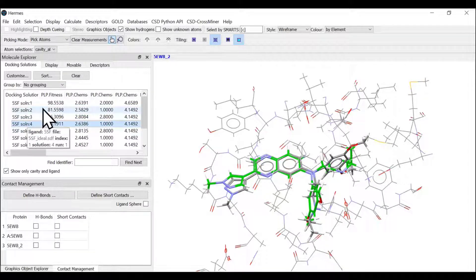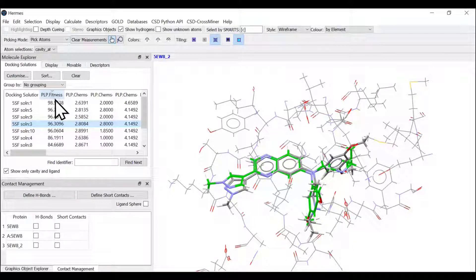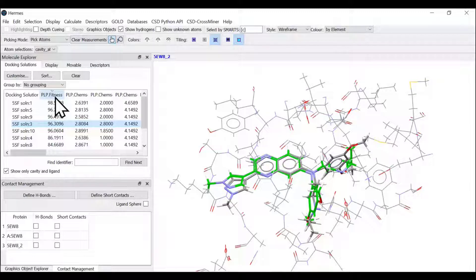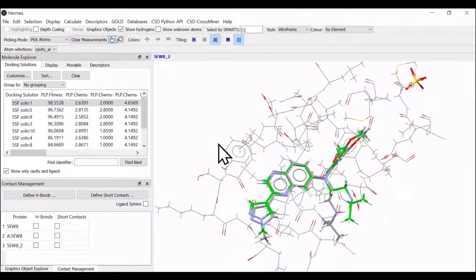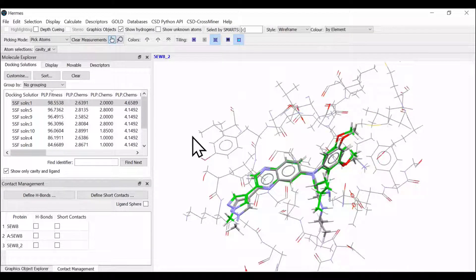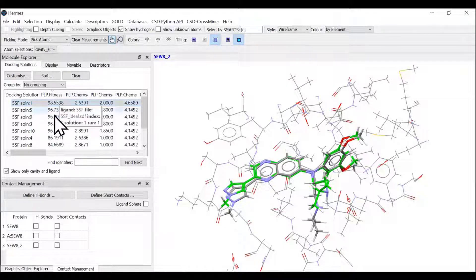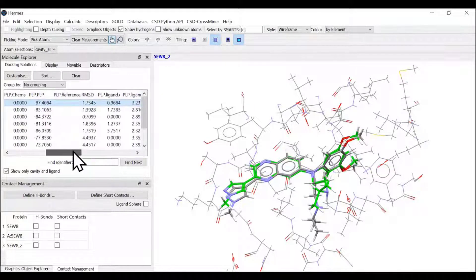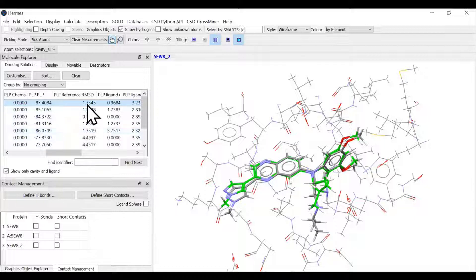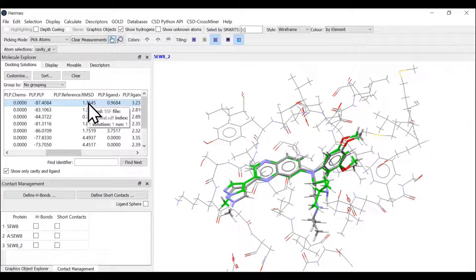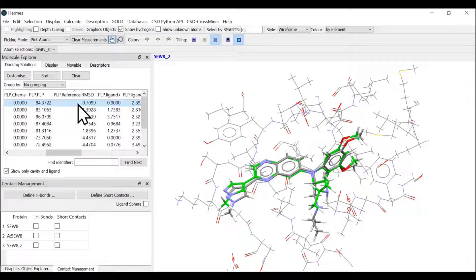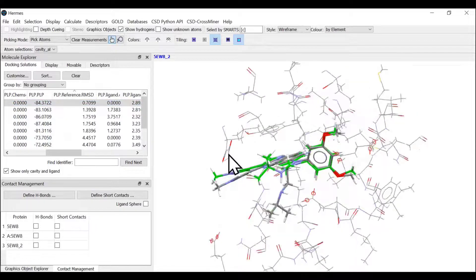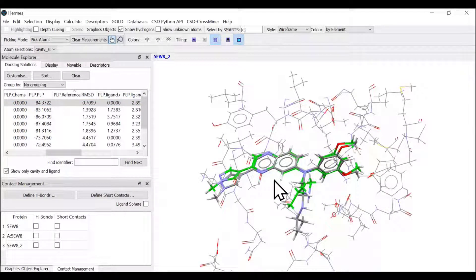For the fitness or scores, you can sort them by clicking on the definition. This is the pose generated from our docking calculation with highest fitness score of 98.55. Let us see its RMSD. We have the best RMSD of 0.709, which can be sorted out, and you see the docking is completed—it's a really nice pose. We have a very nice overlay here.